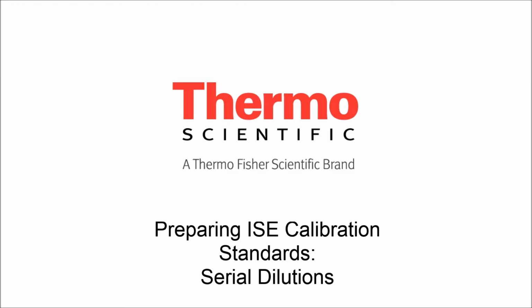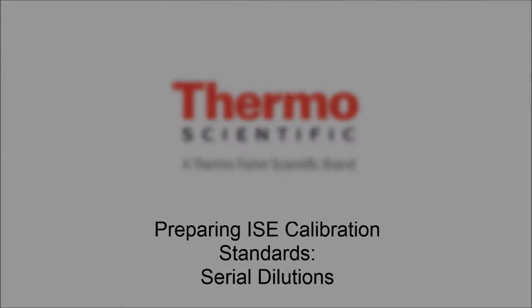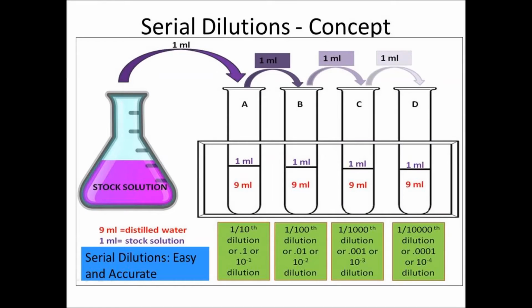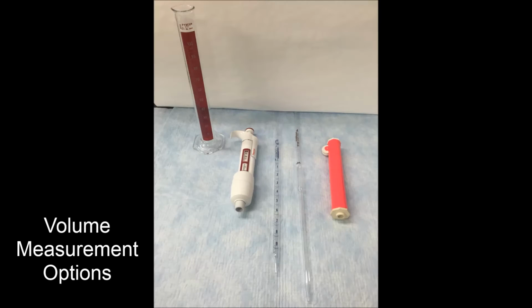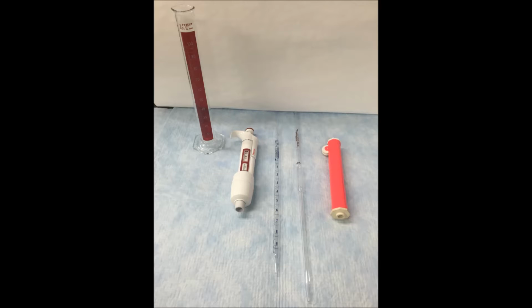Today we are going to discuss how to prepare calibration standards through a serial dilution. A serial dilution is when you use a concentrated stock solution to create a set of 4 different dilutions. The basic lab equipment you will need will be a volumetric glassware and materials to make calculations. For volumetric glassware, we have a couple different options of a pipetter, graduated cylinder, or a graduated pipette.